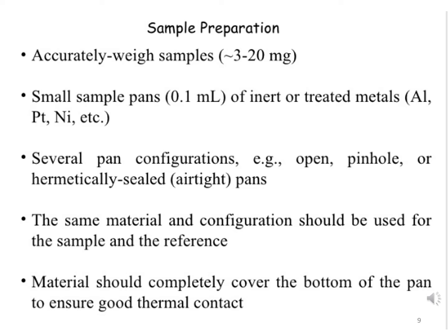If we are using a sample pan made of platinum, the same pan should be used for reference. Sample and reference pans should both be made of platinum.